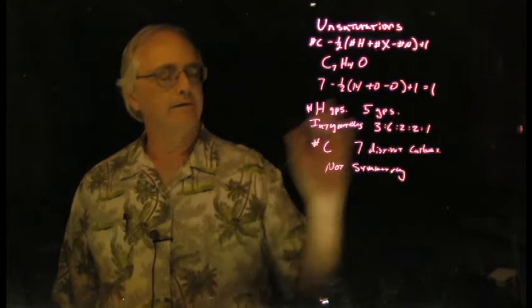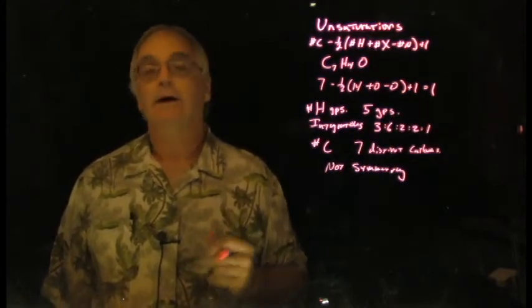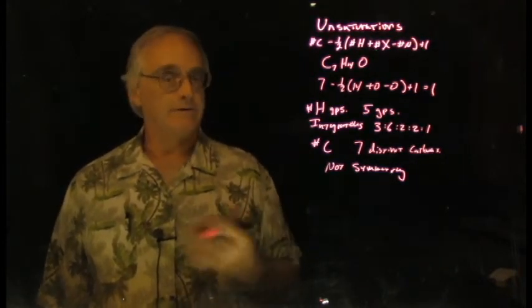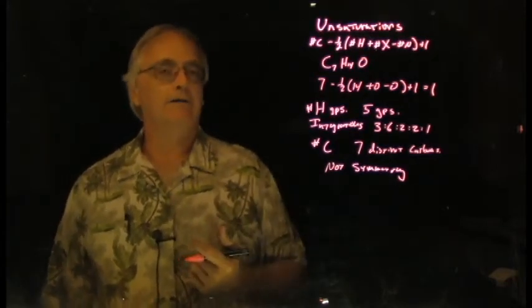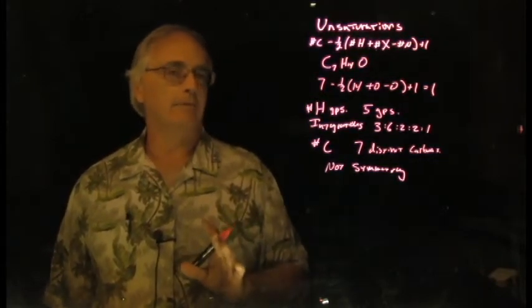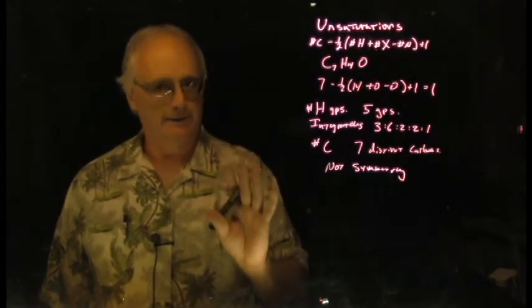We already know it's not aromatic because of the index of unsaturations, but clearly we look at the chemical shifts and we see nothing around 7, which in the proton spectrum is a clear indication of aromatic. There are a variety of peaks in there, and one up around 9 ppm is really telling us something important, but we're going to save that for later.